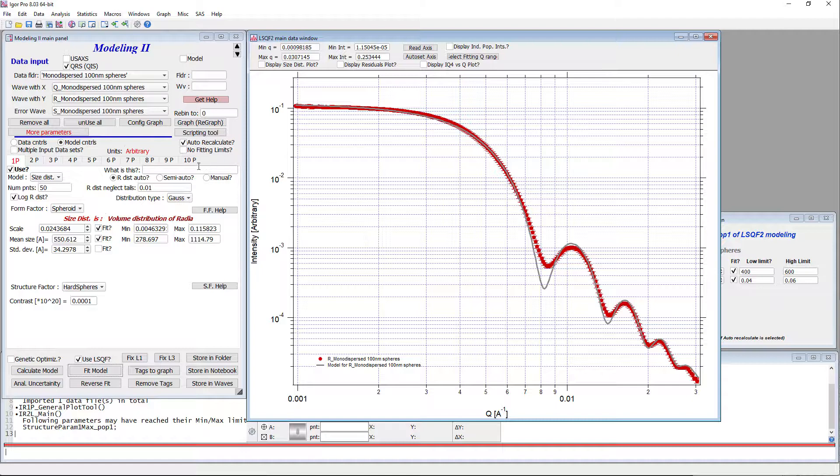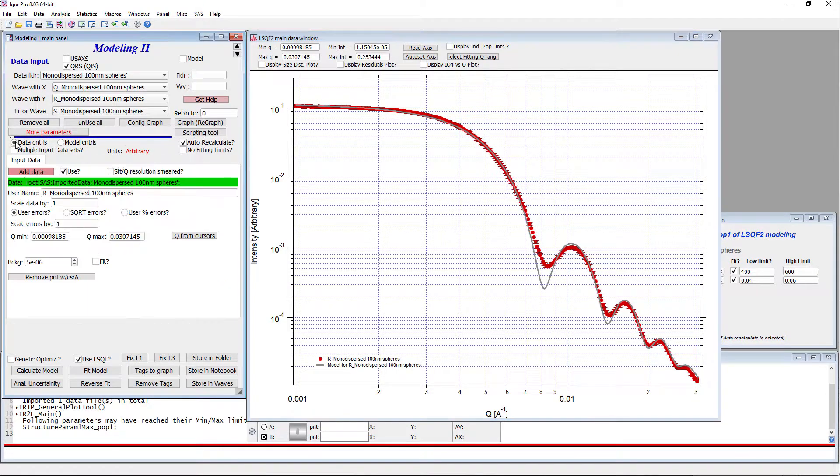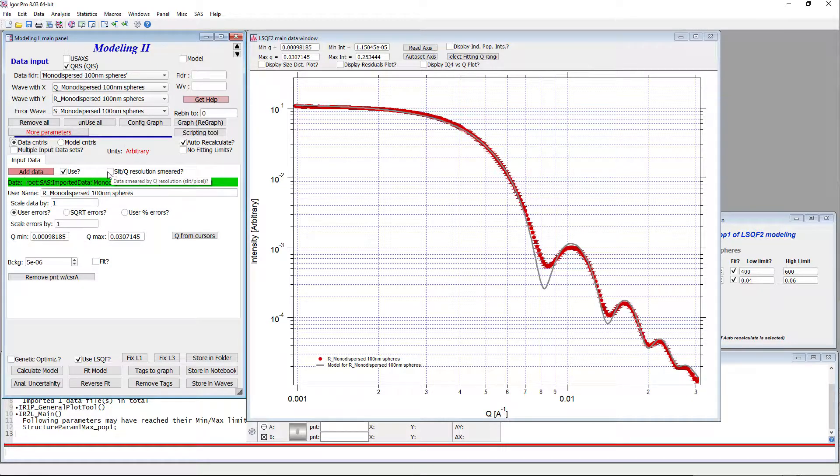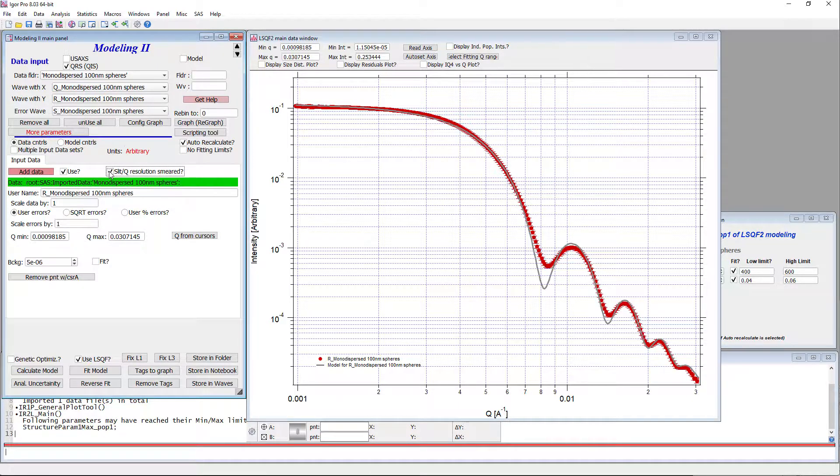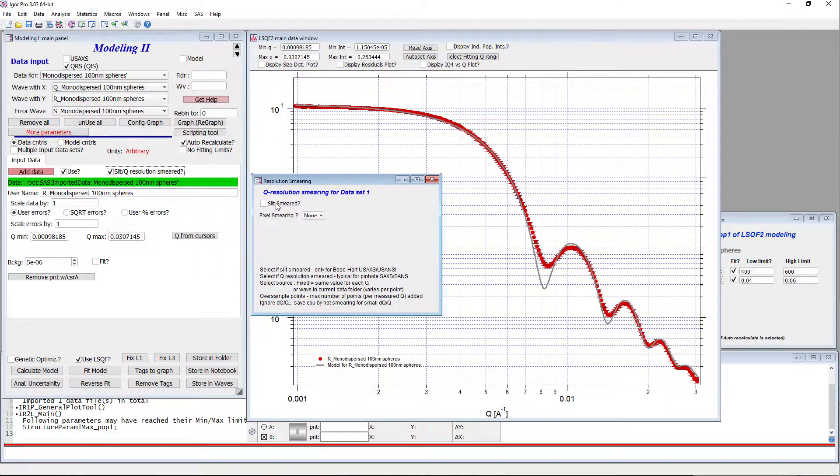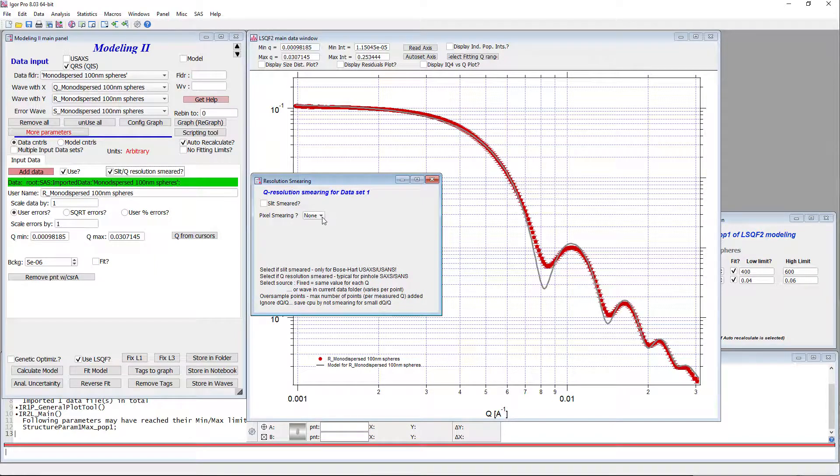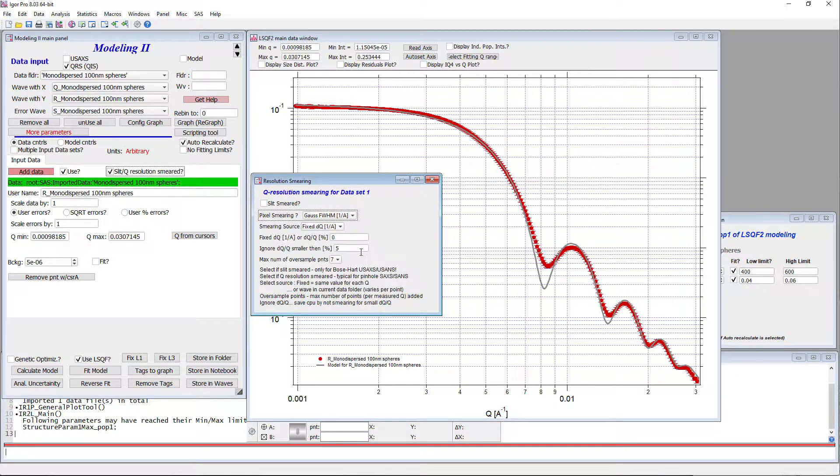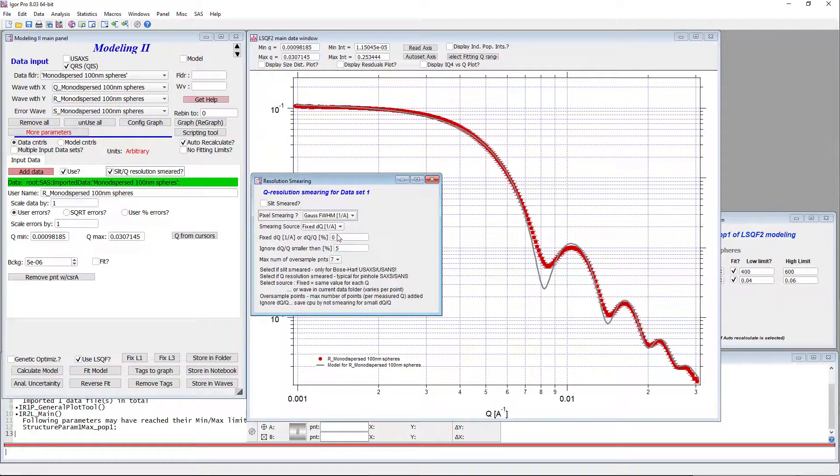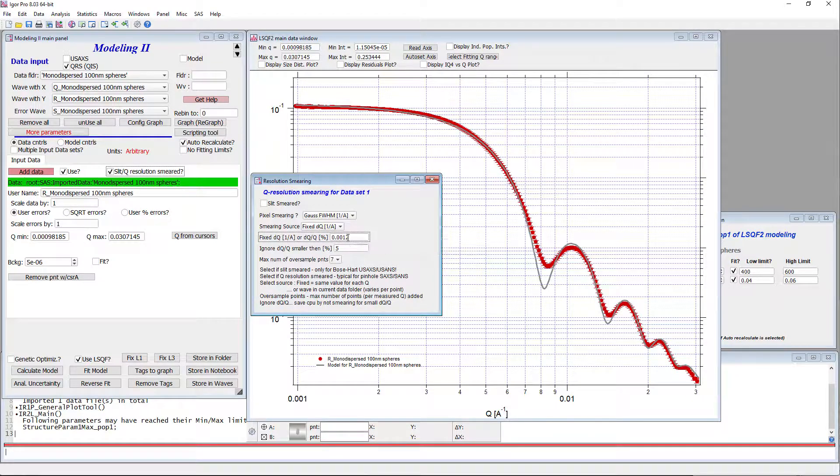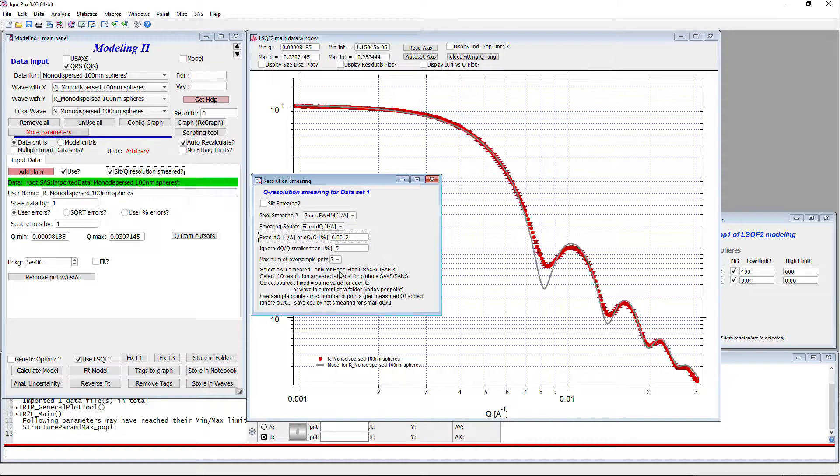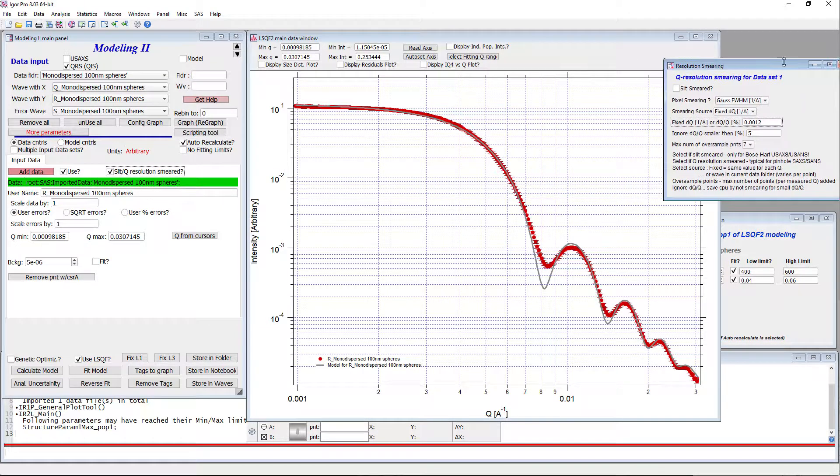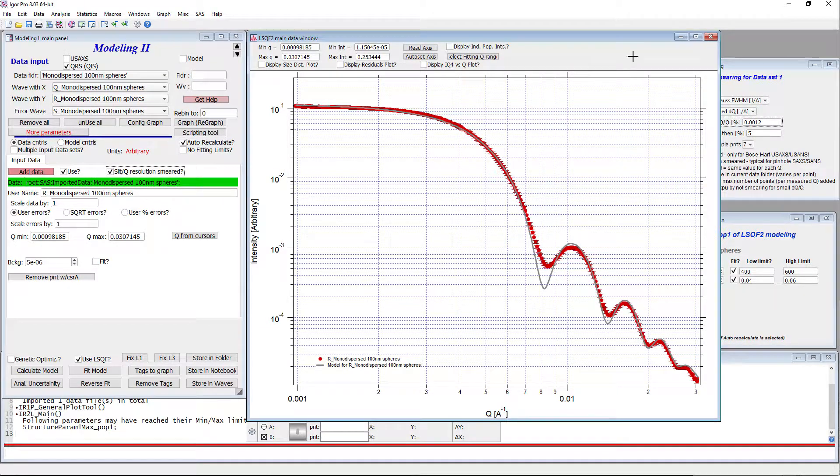IRENA can account for that. So you can go in data controls. You can say I have either slit or Q resolution. So I can click on that. Now this is not slit smear data, but these are Q resolution data. So it's just big. The typical one would be Gaussian full width at half max. And I'm going to use a fixed delta Q for every point. And more or less you can ignore the other parameters on that thing. This should work.